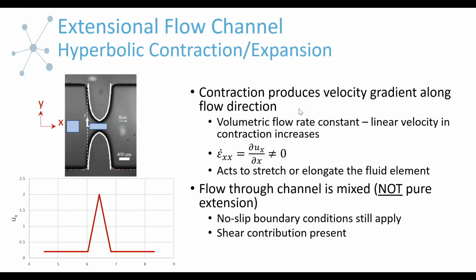And so getting the uncorrected viscosity could be a useful parameter, because it is hard to separate them out and try to use only one versus the other. So I don't think that's a straightforward question to answer. I think ideally you'd want to look at the resistance to flow and something that might mimic reality that is really shearing and extending the fluid, which could be the hyperbolic contraction. That's possible.